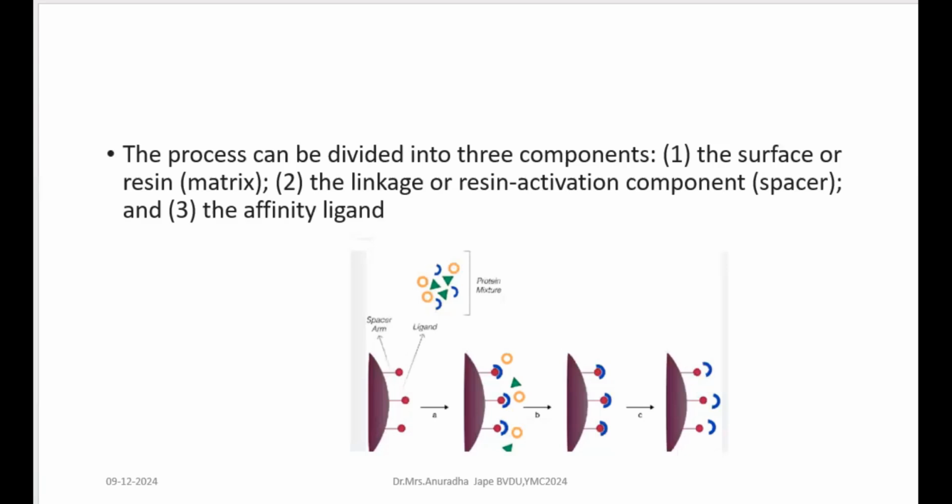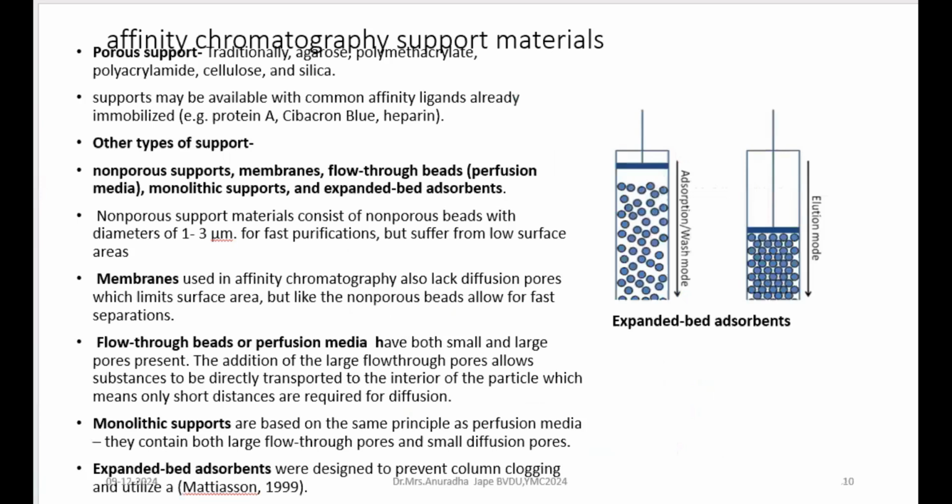These have epoxypropoxy groups, which are the particular groups that are going to interact, one with the support, another with the ligand, and in between you have a hydrocarbon chain, right? So hydrophobicity, hydrophilicity, functional groups, polarity, all these things are to be considered when we are talking about the spacer arm, right? Now let's go to the next slide.